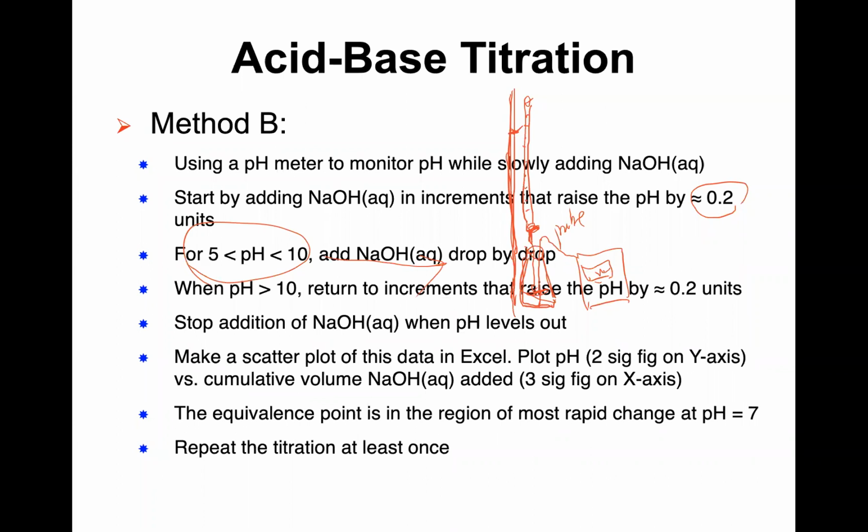Right? Remember this titration curve goes here. In this range it goes so fast, but after that it will go slow. Only when it goes here is your end point guaranteed to be achieved, right? So after that, when you titrate using a pH meter, we ask you to titrate until the pH goes to 11. In this case, you can construct a complete range of the titration curve for this one, right?